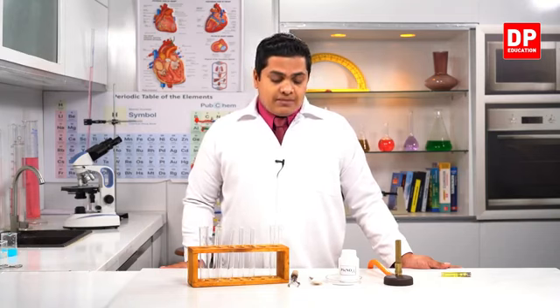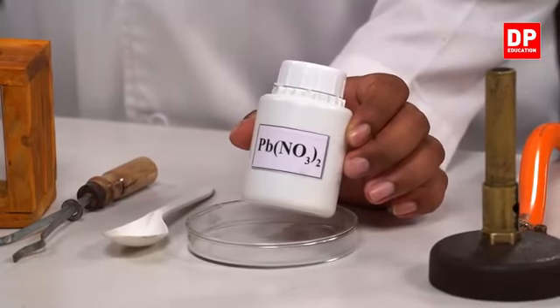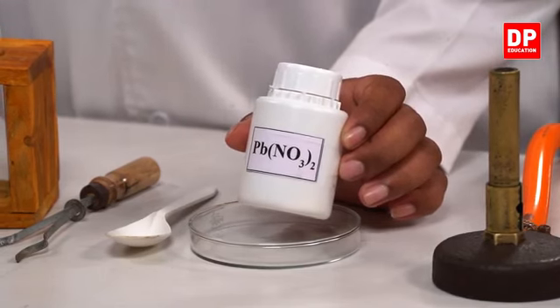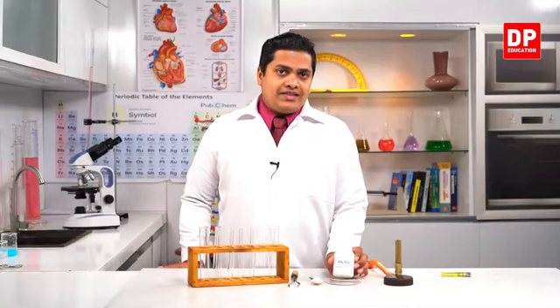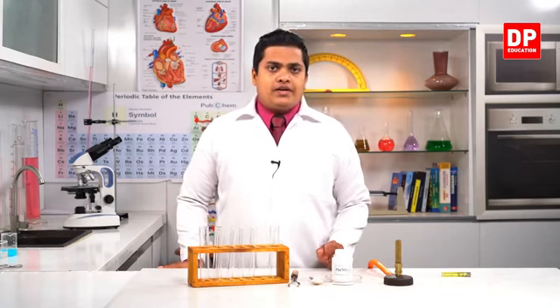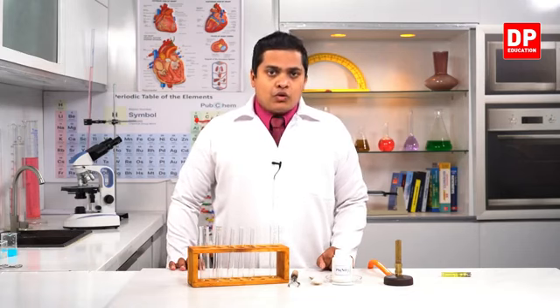So in the first activity, we'll be heating lead nitrate. So here Pb(NO3)2, within brackets you can observe there is a 2. So this is the chemical formula, Pb(NO3)2, lead nitrate. So we are going to heat up lead nitrate in this activity to observe what will happen during a chemical change. How can we say whether a chemical change has happened or not? What are the evidences to show that there is a chemical change or not?